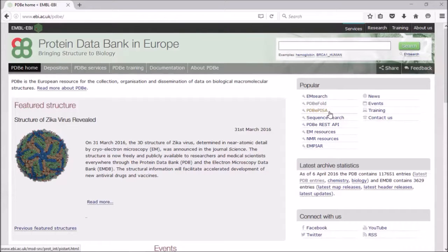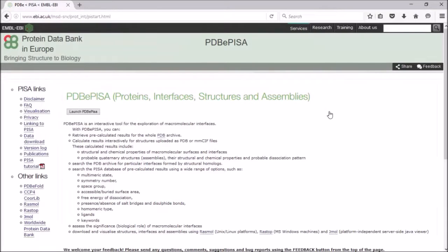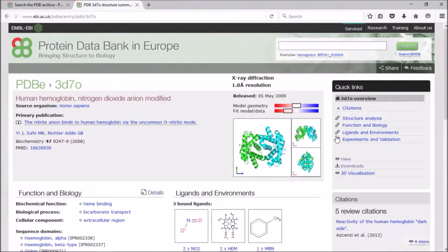Again, from this page, you would launch the service, and there's the launch button here, and PDBe PISA will find likely assemblies based on crystallographic interfaces.